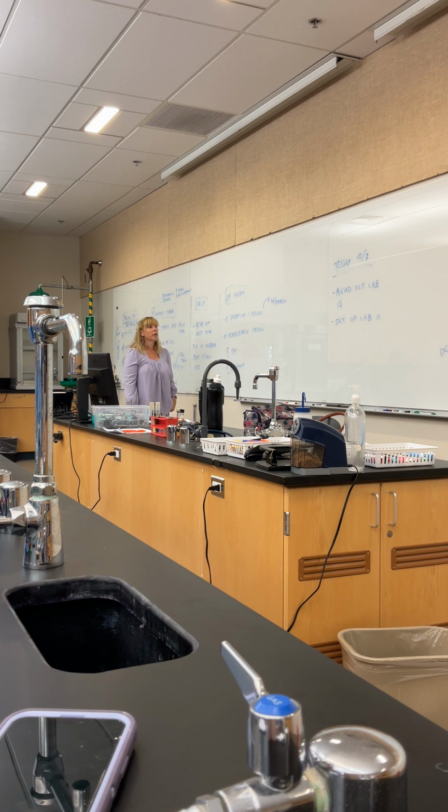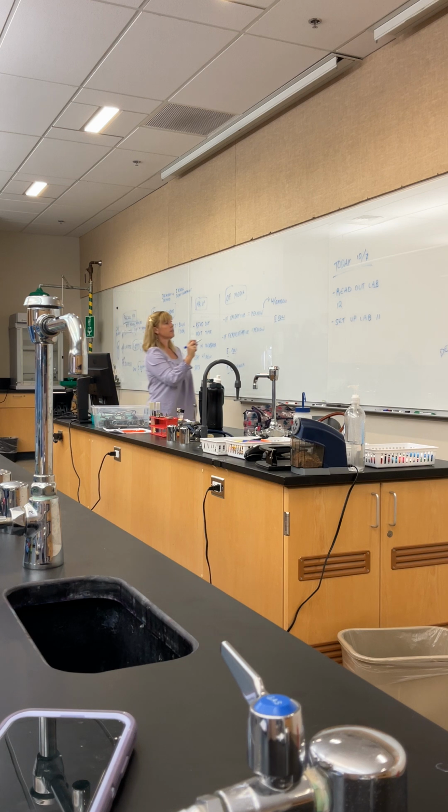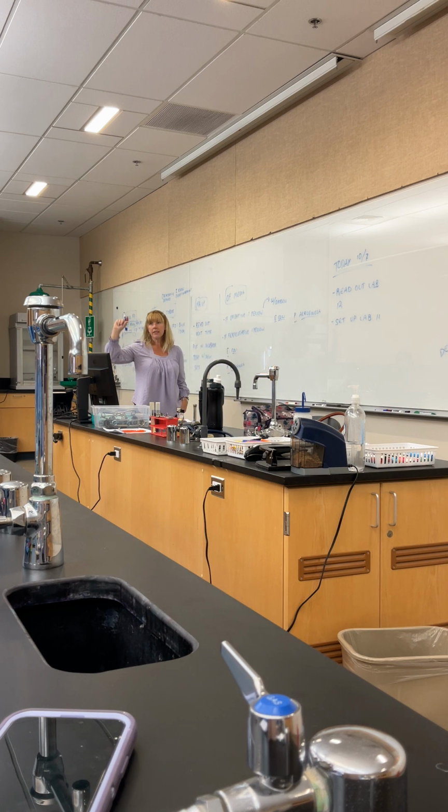Okay, which organisms turn yellow? Okay, did our Pseudomonas turn yellow at all? He should. Let's see. Yeah, he's yellow. So see at the top how he turned yellow? So Pseudomonas is also yellow as long as there's oxygen present. Do you see how he doesn't turn yellow really deep? Yeah, he's just at the top.